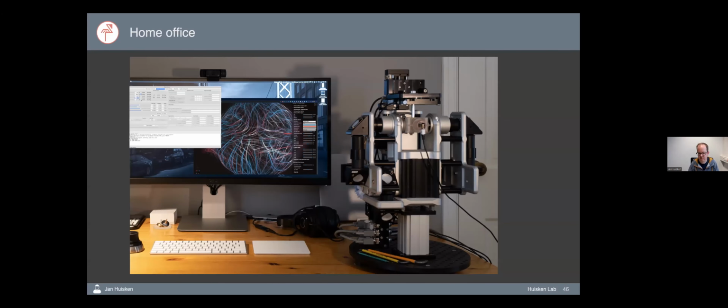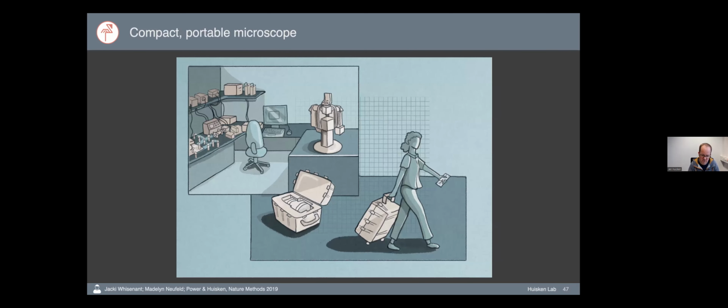Because when the pandemic hit, we realized that these systems are actually portable. I haven't mentioned this, but I just said that they are very compact. I was able to take one of these systems home into my home office, and we learned that they can even be remotely controlled quite nicely. And so the idea was born to take these instruments, not just take a complex setup off the optical bench and have it in a more compact form on an optical bench, but rather, taking them with us wherever we go and to whatever collaborator we want to collaborate with.